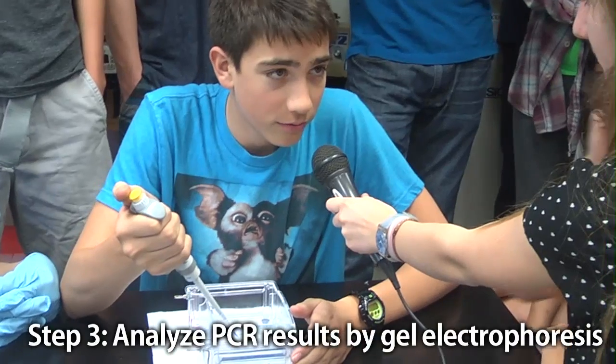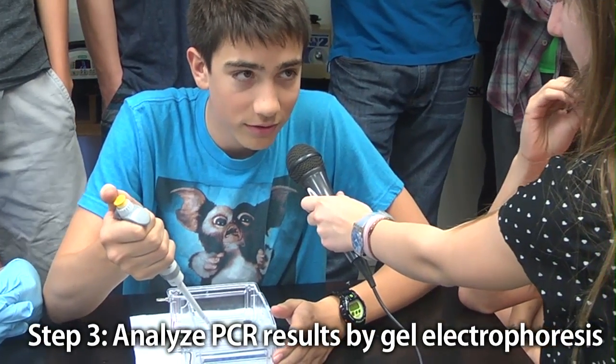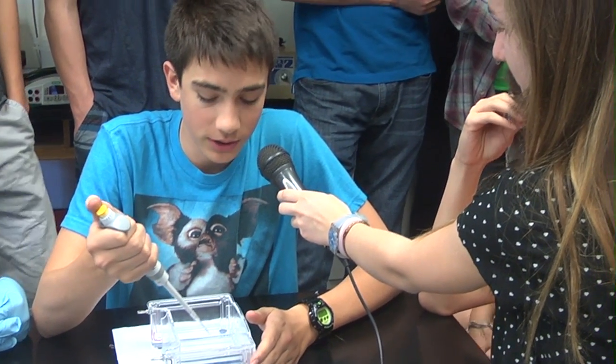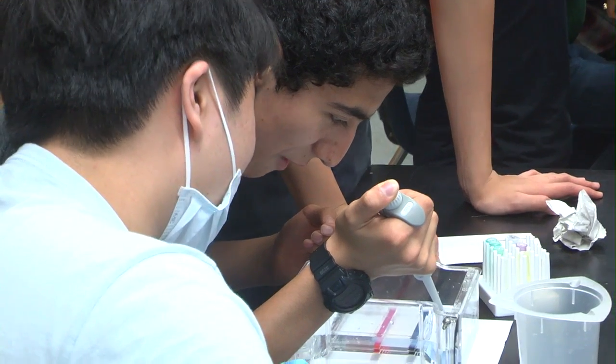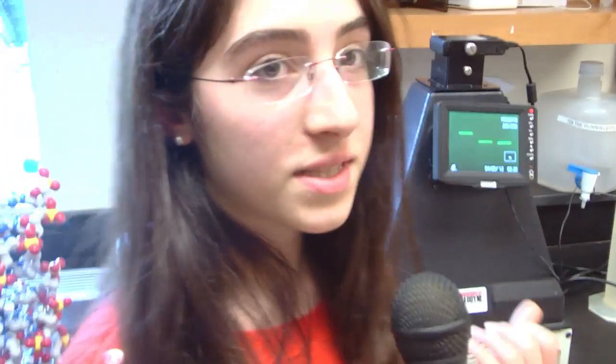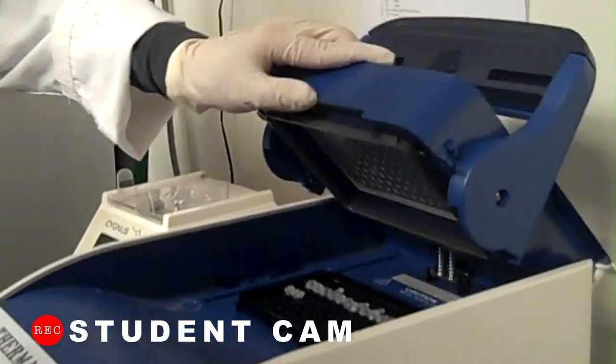Why is the DNA blue? Because we colored it with something blue. Why did you do that? So we can see it and observe it better. Otherwise, if it was just transparent, it would look like nothing was happening. What I found out was that PCR will copy the part of the DNA that we were looking at, which was on chromosome 16.